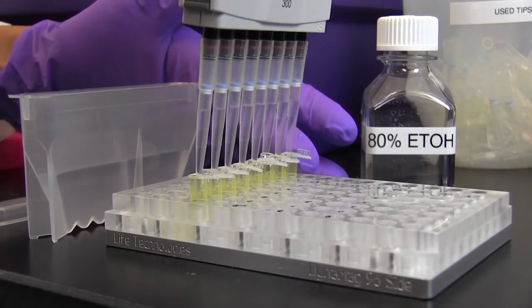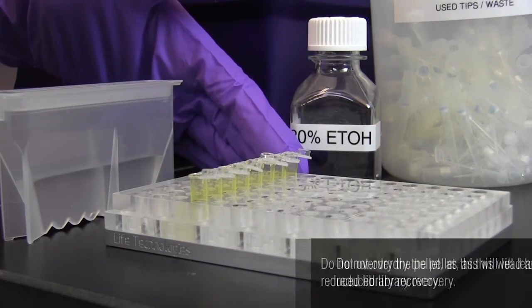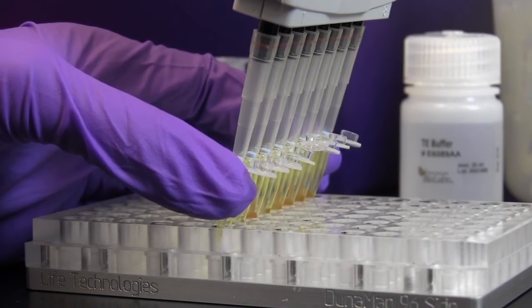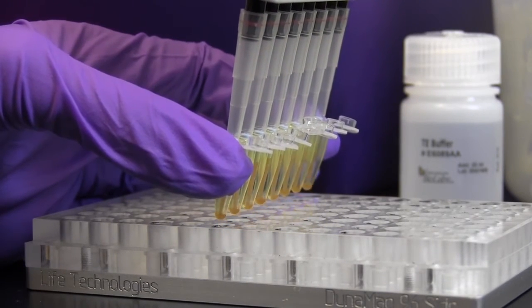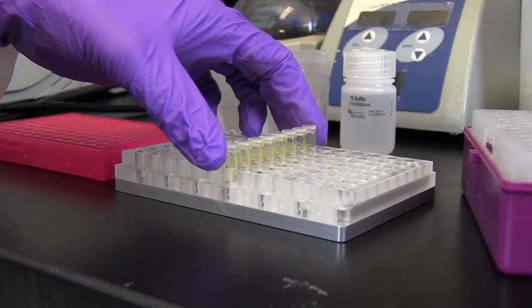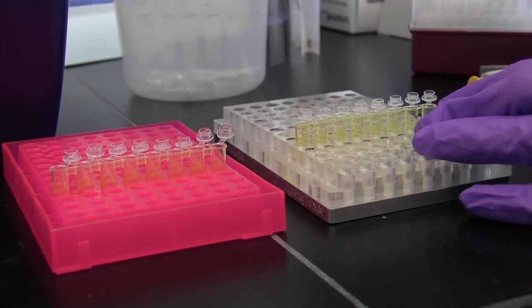Wash the beads with freshly prepared 80% ethanol as previously demonstrated. Allow the pellet to dry. Remove the tube or plate from the magnet and elute the library from the beads by adding 33 microliters of 0.1x TE buffer, followed by mixing well. After a quick spin, incubate at room temperature for two minutes. Return the sample to the magnetic field until the sample clears, approximately five minutes, and remove 30 microliters of the supernatant containing the library to a new tube.